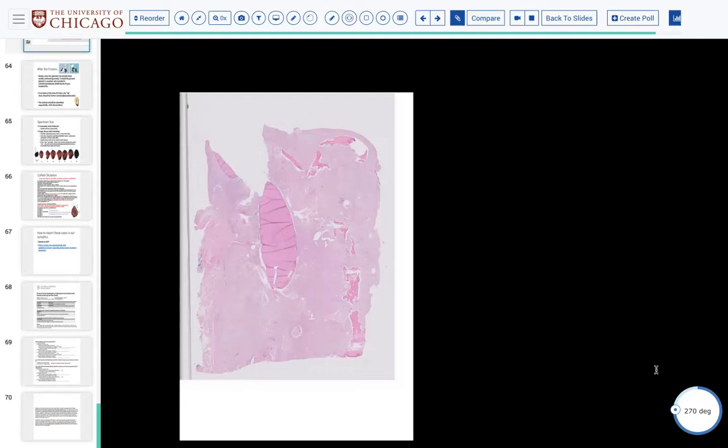So should we use eosin or not for very small transparent tissue? I mean, if it helps you, yes. If it doesn't help you, no. I think everybody has a different experience and preference, but if it doesn't affect the tissue itself. So if you find that it helps your cutting, use it. If you find that it doesn't help your cutting, don't use it. The one thing I will say is, it is okay to go superficial at first to see where you are and if you have entered into the tissue plane.